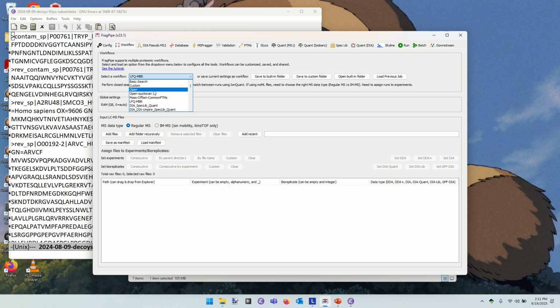But these are the kinds of searches that database search has already been very good at since 1995, basically. That was when it was first published, how to go about doing variable modification searching. You specify an amino acid on which this change can happen, what the mass shift is, maybe you indicate what its Unimod identifier is, and then off you go and you're searching, you're good.